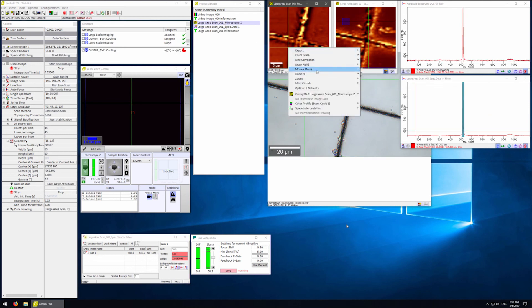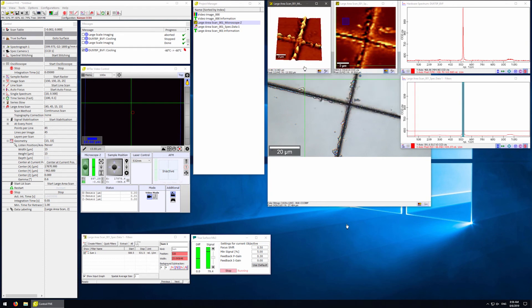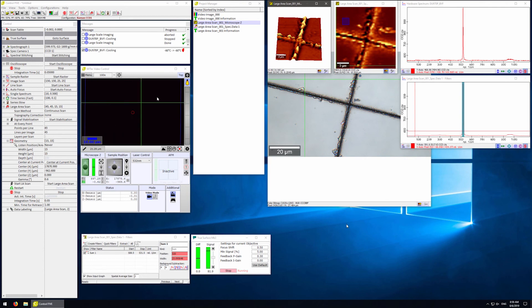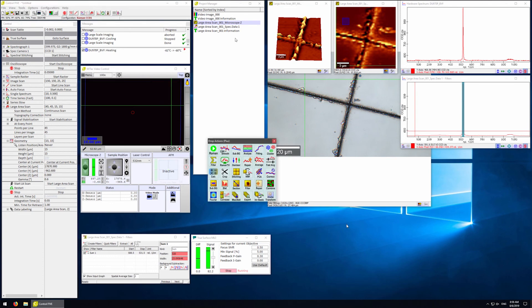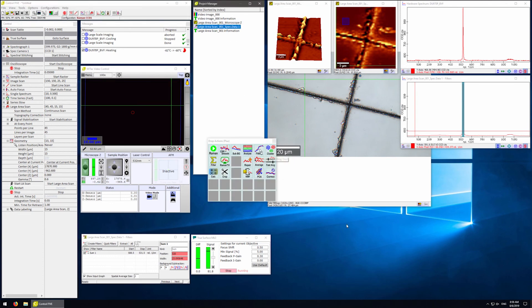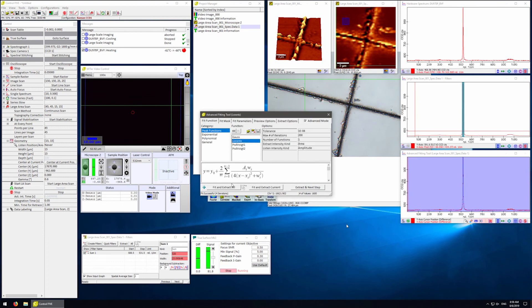You can also render the image in 3D. By opening the drop action menu, you can do more advanced analyses, such as peak fit, to display various peak parameters.